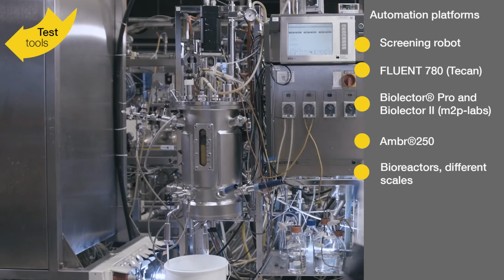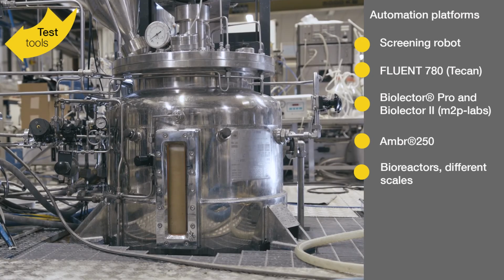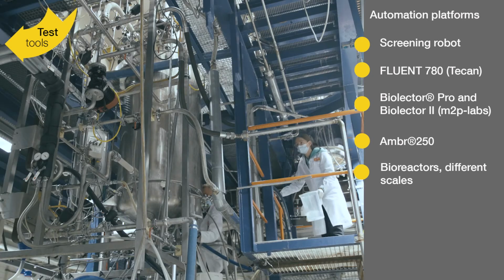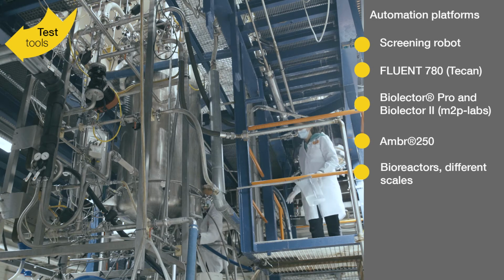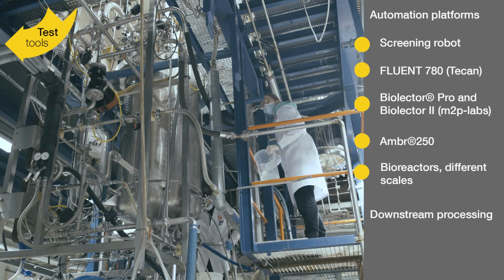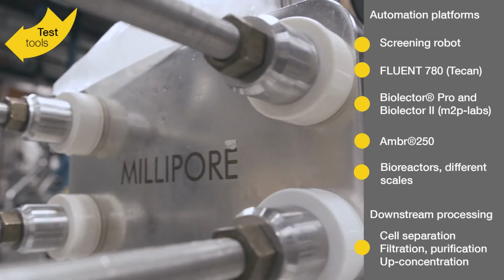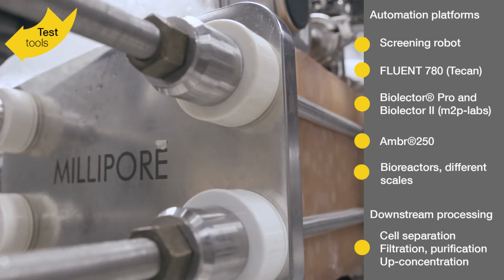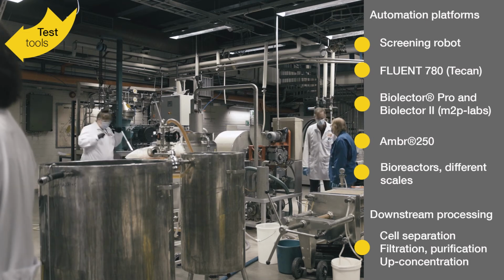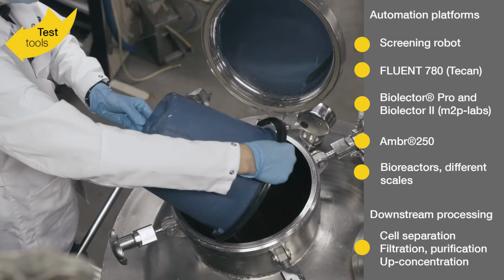We have standalone reactors, 10, 20, 50 liter scale, and then also the piloting equipment, and that's ranging from 50 liters to 1,000. And then we have quite well equipped downstream processing equipment system downstairs, so we can do cell separations, filtrations, up concentrating of broths, and various types of downstream processing steps there.